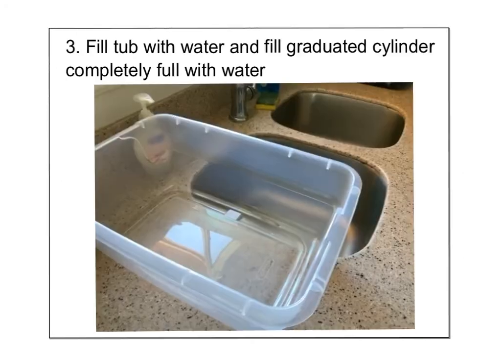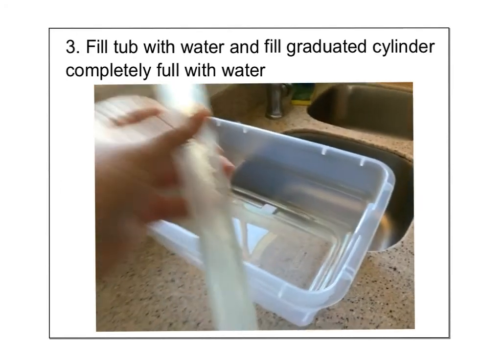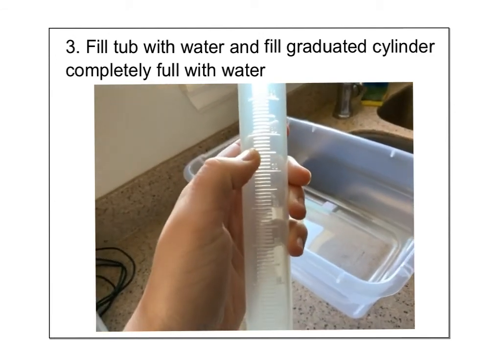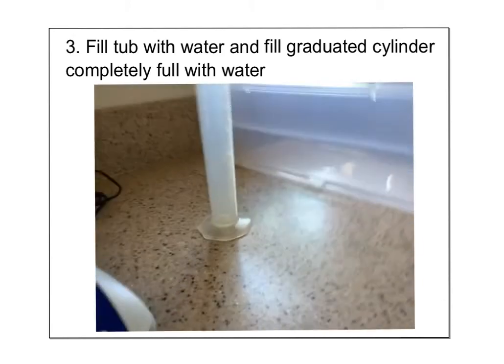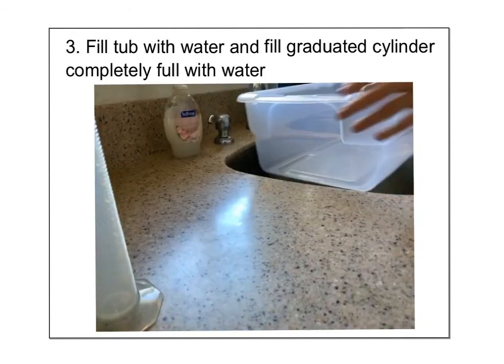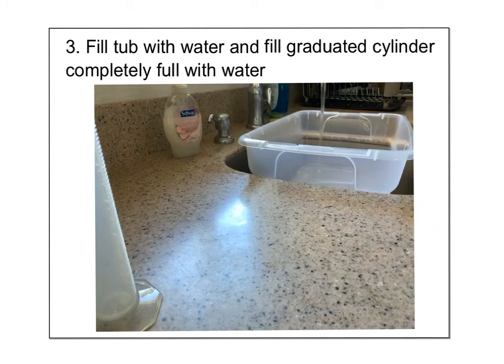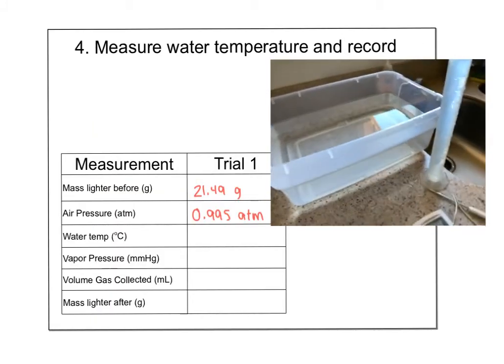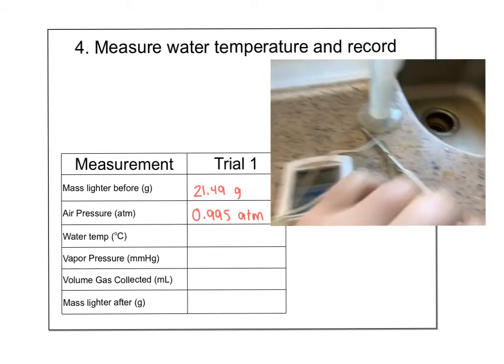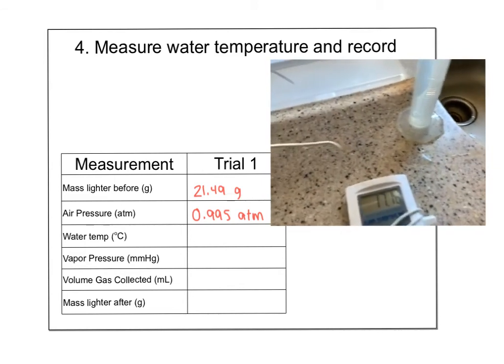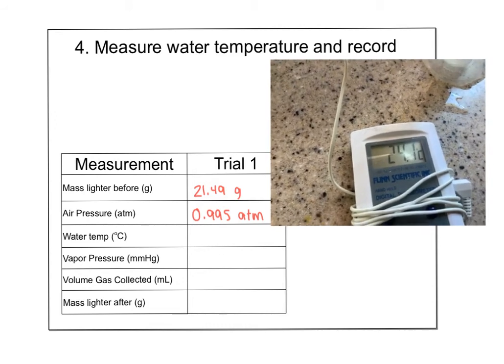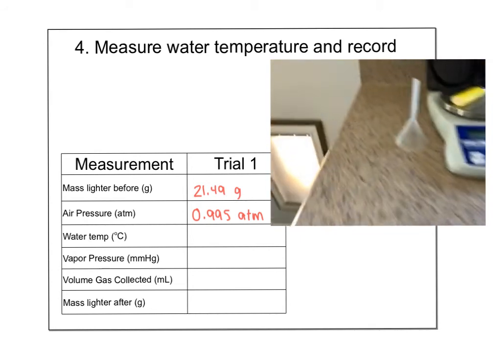Next we fill the tub. We're using a graduated cylinder instead of a volumetric flask so I can collect as much gas as I want and record exactly what we get without needing to hit a perfect fill line. I'll fill the graduated cylinder all the way to the top with water — no air bubbles. Using a digital kitchen thermometer to take the water temperature, I get 24.21 — so 24.2°C.